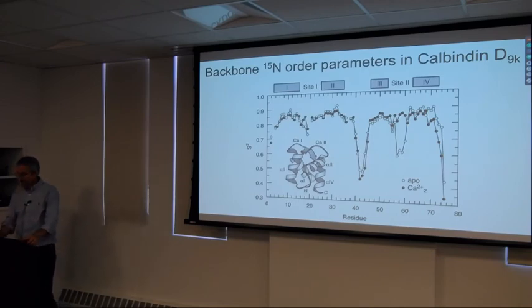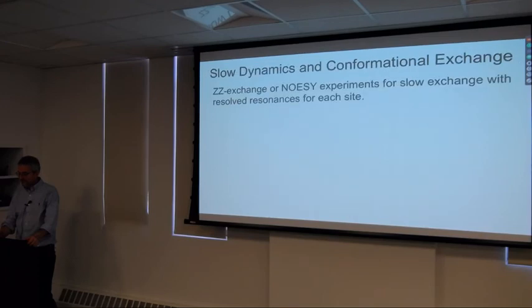Okay, I left out somehow, maybe it comes up later, maybe not. I left out perhaps the other main application, and that is, of course, one could be interested in the change in overall tumbling.